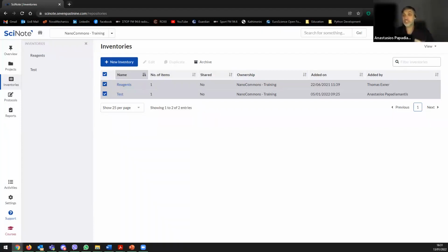The only difference is that if you want to invite a person into a specific team, then you need to send an email, as I showed you, so that the people can accept the invitation. It will let you know that the person already has an account. That's the only thing.